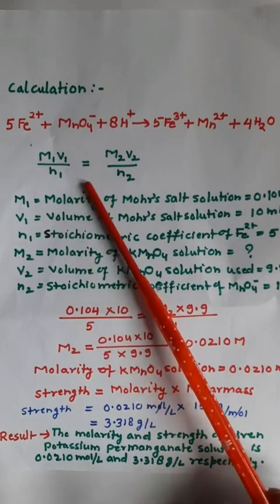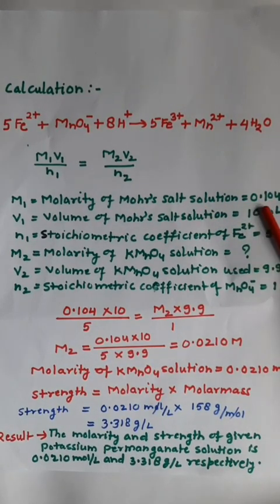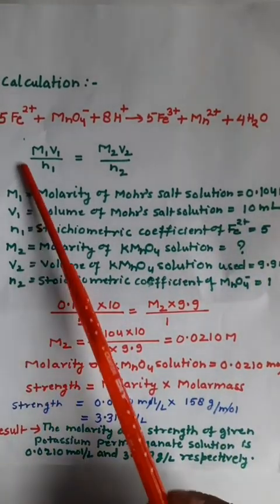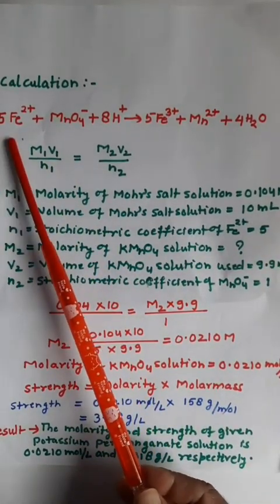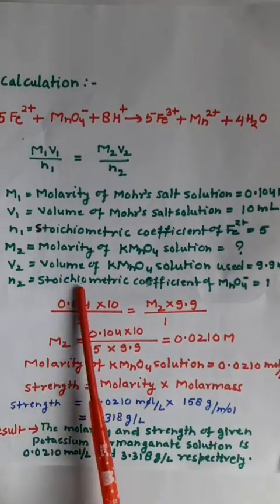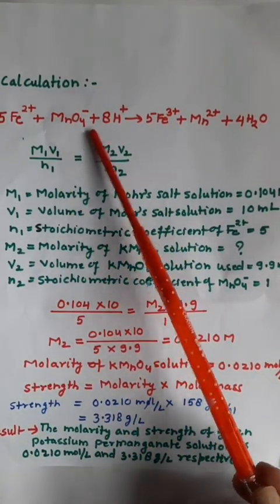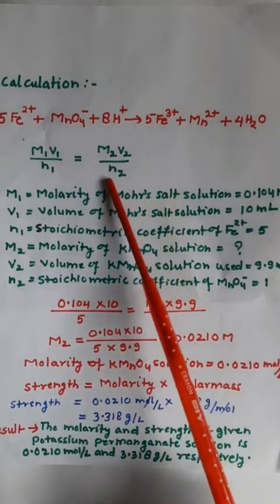Now you have to describe what these variables are. M1 is the molarity of the Mohr salt solution that you have prepared, which was found to be 0.104 moles per liter. V1, the volume of Mohr salt solution taken during each titration, is 10 ml. N1 is the coefficient of Fe2+ ion in the balanced redox reaction, and here the value is 5. Next, M2 is the molarity of the KMnO4 solution that you have to determine, and V2 is the volume of KMnO4 solution used, which is the concordant reading. It comes out to be 9.9 ml, as you have observed in the video. N2 is the molar coefficient of the MnO4- ion, and its value is 1.